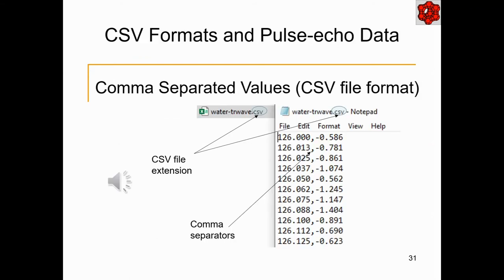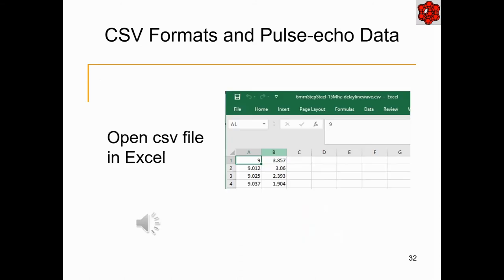The MAPIS template has been configured to easily permit importing waveforms that have been saved in TXT format. Some ultrasonic equipment manufacturers use the TXT format with tab separated columns. Other manufacturers provide the waveform data in CSV format where CSV denotes comma separated values. To use data from software that has stored the waveform in CSV format, MAPIS requires a conversion of the CSV file to TXT.